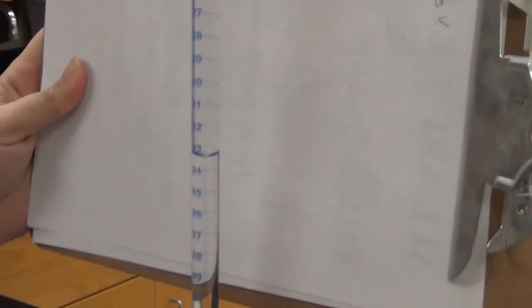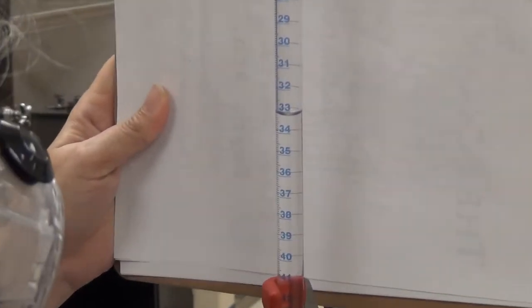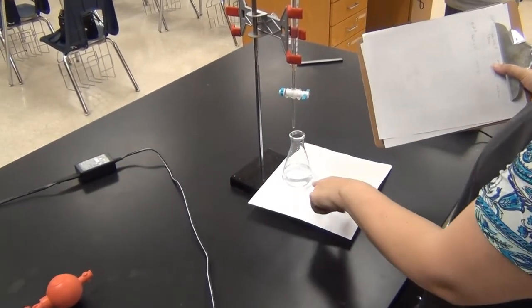Again, we put a white piece of paper behind it, we get eye level to it, so I have to bend down a little bit. And then between 33 and 34, and conveniently enough, and I promise I'm not faking this, that is 33 point two zero. 33 point two zero.